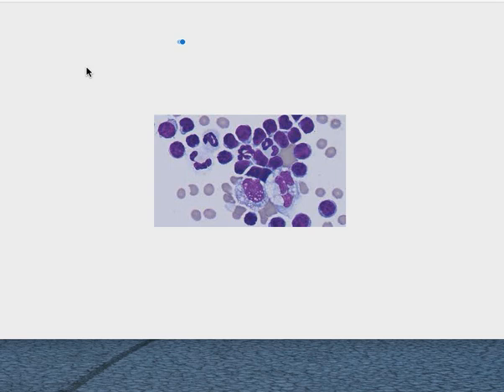So once you've got it stained and you look at it on the microscope, you do want to first look around on low power. I can't stress this enough. If you go up to high power, you're going to miss stuff, or the veterinarian's not going to be able to see what they want to see on the whole slide. So make sure that you leave it off oil. One of you guys already mentioned my doc doesn't want us to go to oil without him looking first, and boy, that's how I've been raised in a clinic too. So be careful about going to oil if you've got something interesting on there. They want to look at it before you do.